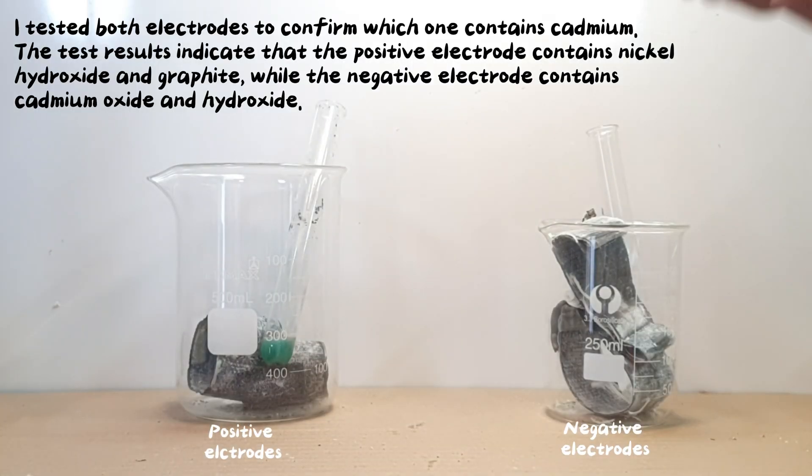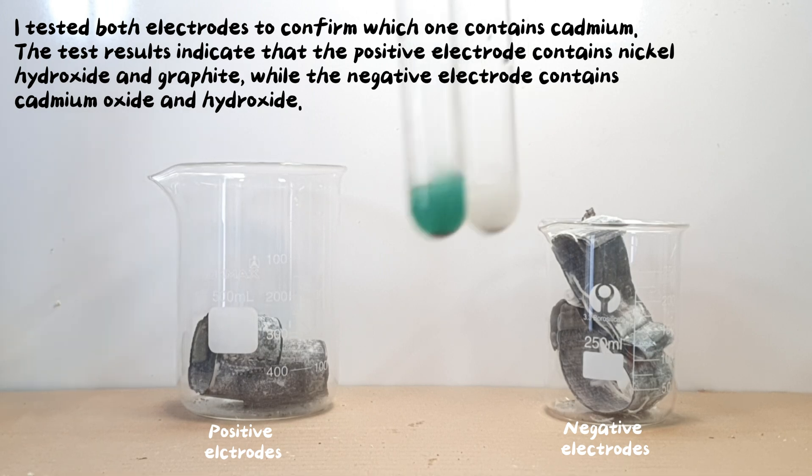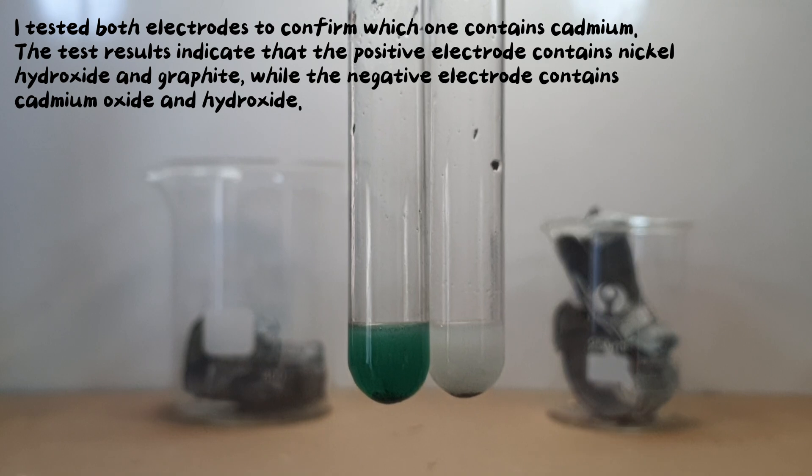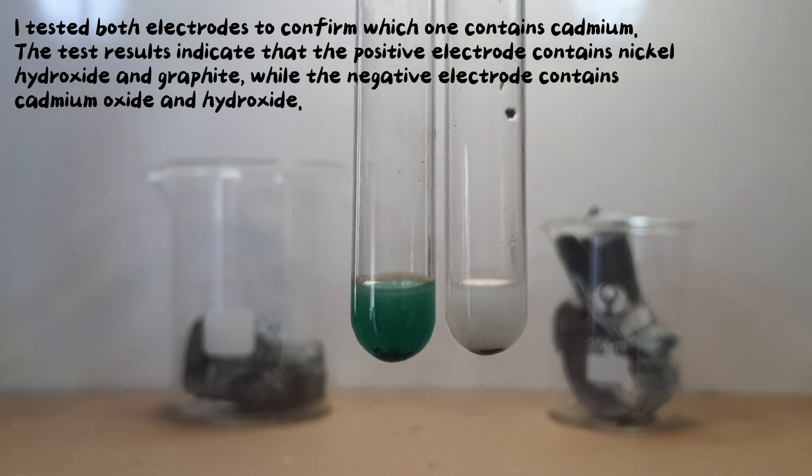I tested both electrodes to confirm which one contains cadmium. The test results indicate that the positive electrode contains nickel hydroxide and graphite, while the negative electrode contains cadmium oxide and hydroxide.